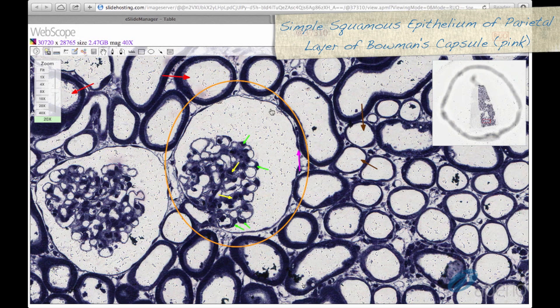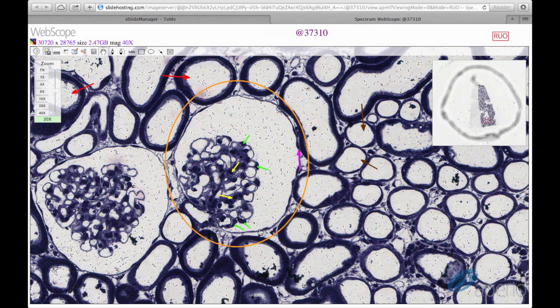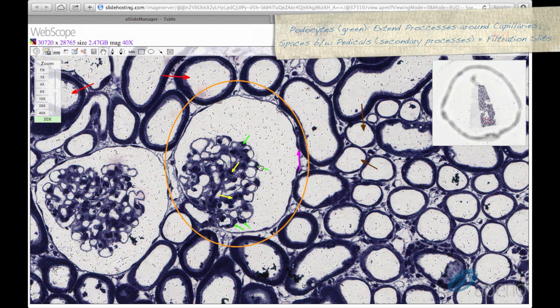Here we can see the simple squamous epithelium of the parietal layer of Bowman's capsule, here at the pink arrow. We can also identify podocytes, here at the green arrows. These extend their processes around the capillaries and develop secondary processes, known as pedicels. The spaces between the pedicels are filtration slits.